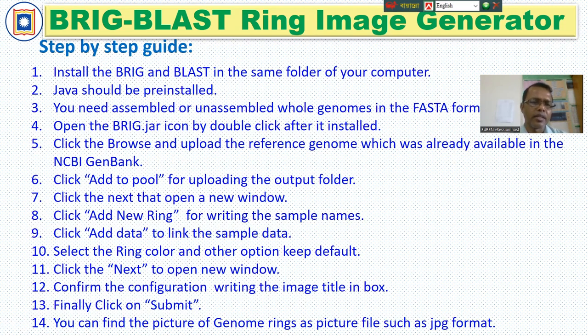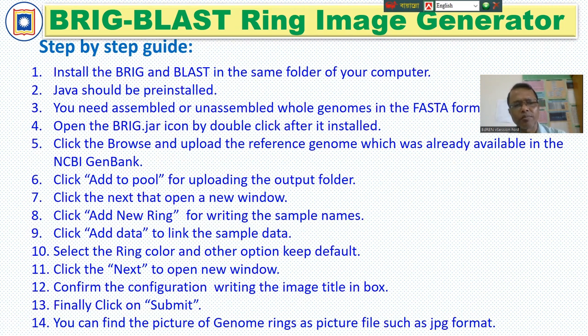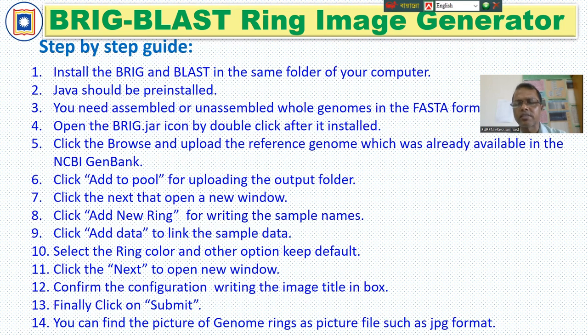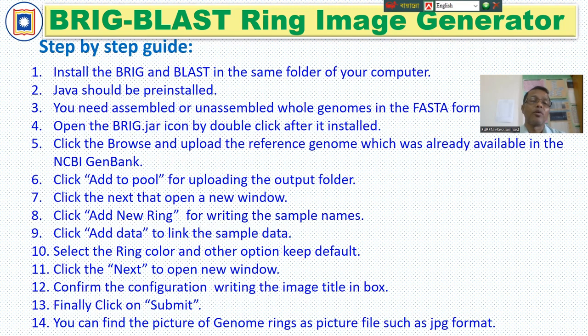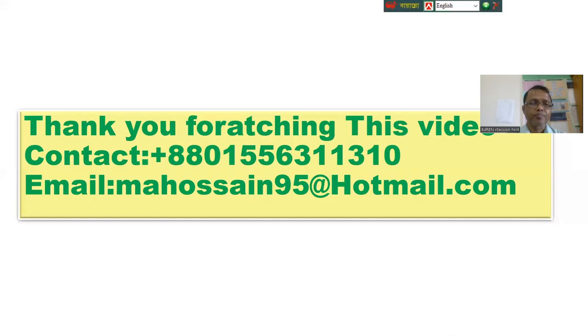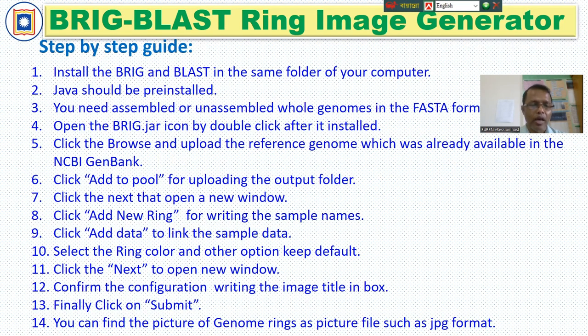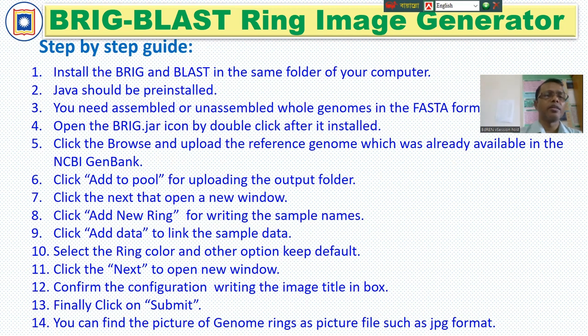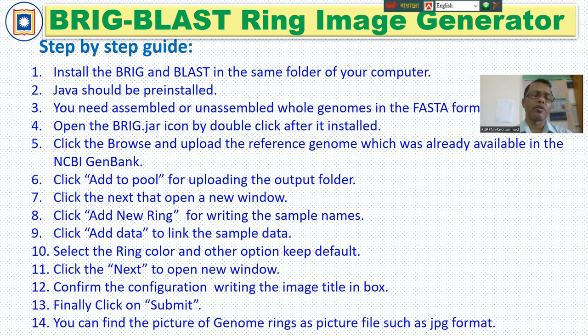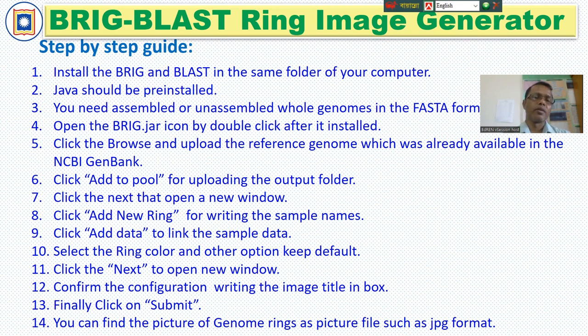Select the ring color and other options to keep default. And click Next to open a new window. Confirm the configuration writing the image title in the box. And finally, click Submit. You can find the picture of the genome ring as picture in such JPG format in your folder where you already have a comment for the deposition of your picture. So, now let's see how to do practically.